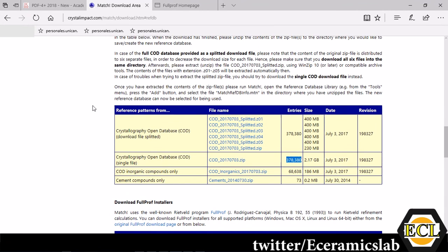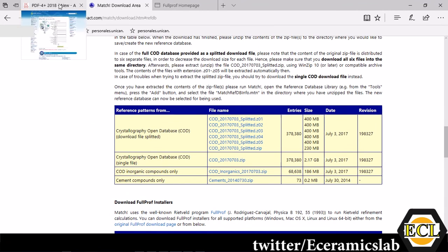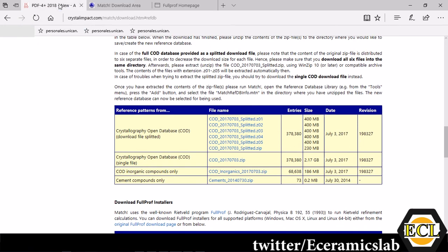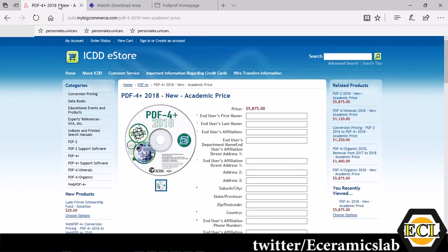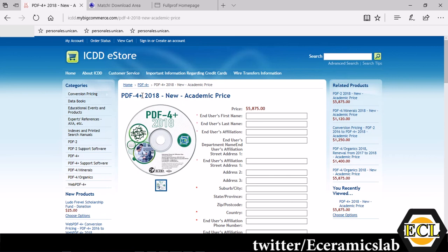You can also have the database which is not free but it is much more authoritative than compared to this one, that is PDF4+. This is costly, you can see it is around $5,875 but people can get this on institute subscription as well.